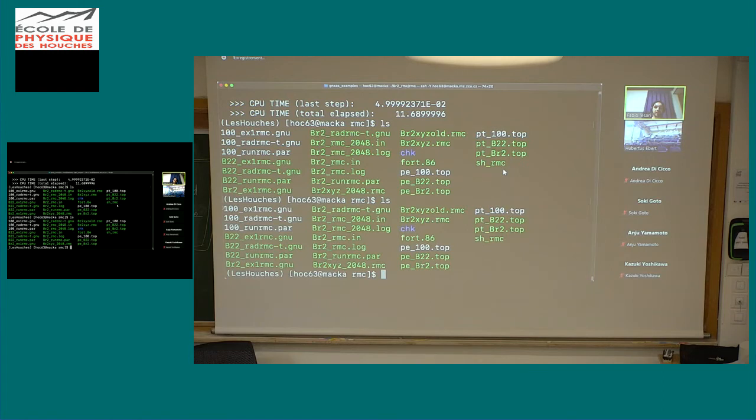All the output files start with the prefix that we chose, that was 100, and important files are these X1 RMC, which are the GNXAS signal and the fitted one. So I will try to plot it.